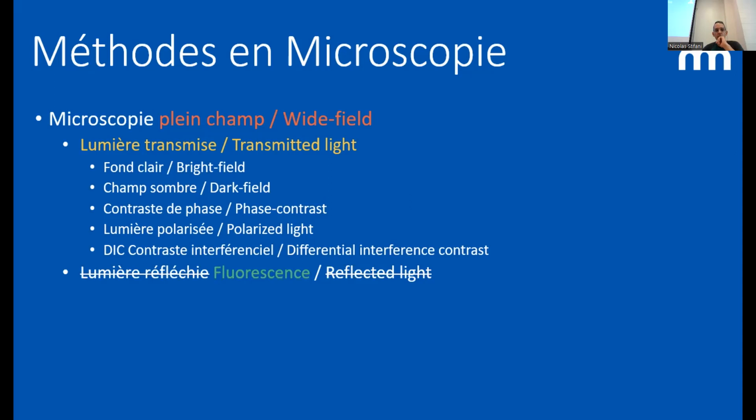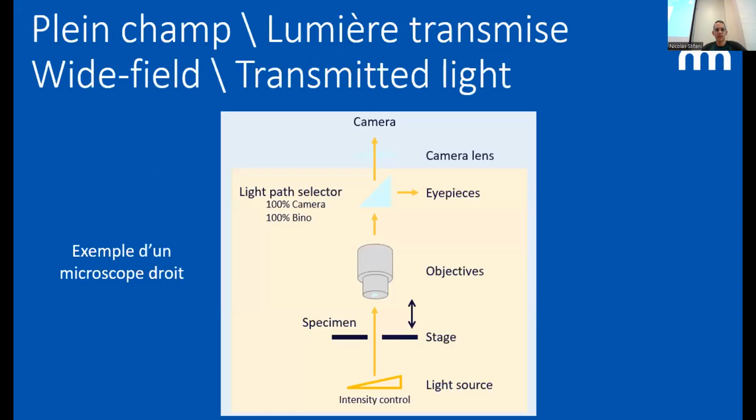It was typically called reflected light, but it's not reflected. If you look at what reflection is, this is not reflected. So I'm going to call it fluorescence. If you disagree with that, please let me know. We can have a full discussion on that.